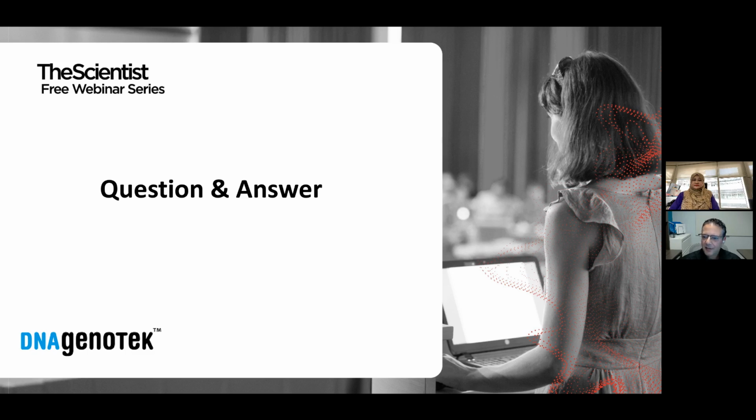Okay. So as far as it being lytic, is there any problem with it being lysed for too long? No, there isn't. Really, once the cells are lysed and the DNA is exposed to the stabilizing solution, that's actually when the sample is most stable. That's because one of the things the stabilizing solution does is inactivate nucleases that are present in the sample.